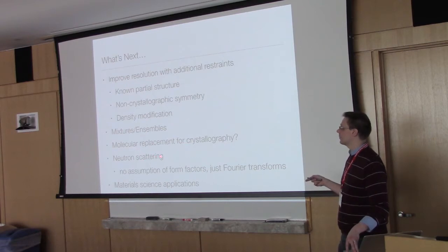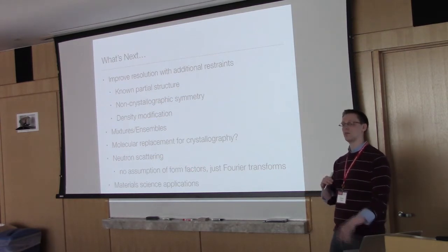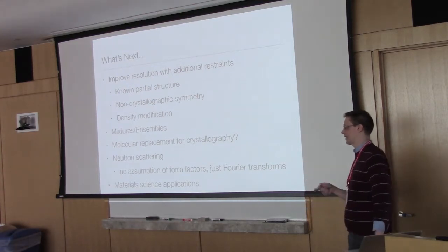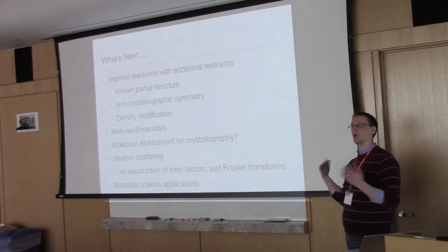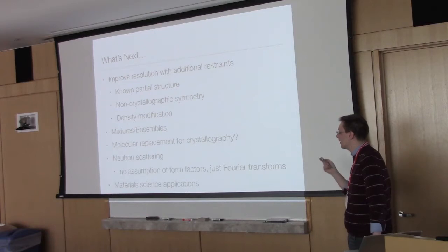crystallography. A neat thing is that because we're just using Fourier transforms, there's no assumption of atomic form factors. There's no form factors at all. It's not coarse-grained, it's not atomic, it's nothing. It's just Fourier transforms, which means it's directly applicable to effectively any type of scattering, including neutron scattering. And so I'm working on some versions that you could incorporate multiple different contrasts and simultaneously fit all of these.